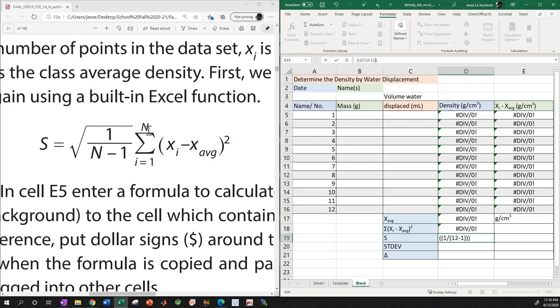Okay, well, we don't have to enter this equation in Excel because guess what? We already calculated it. You see that? All right. So all we have to do is then take this value. So that value is contained in D18.